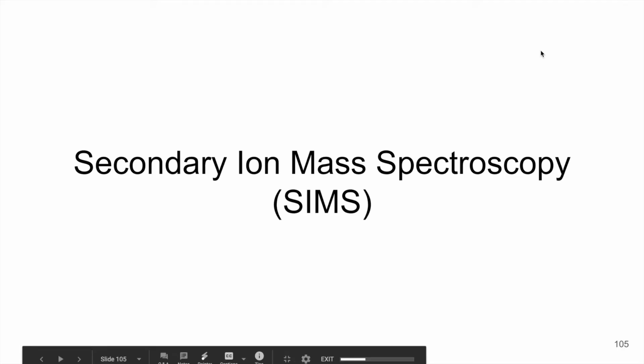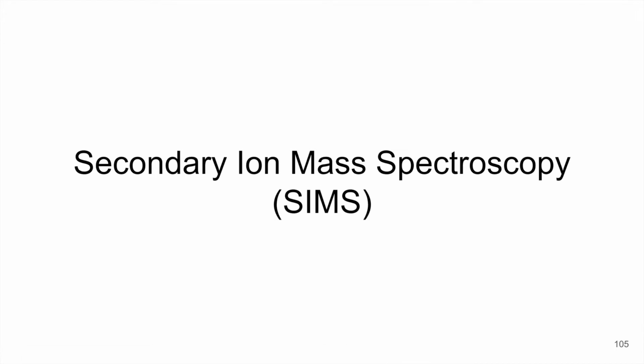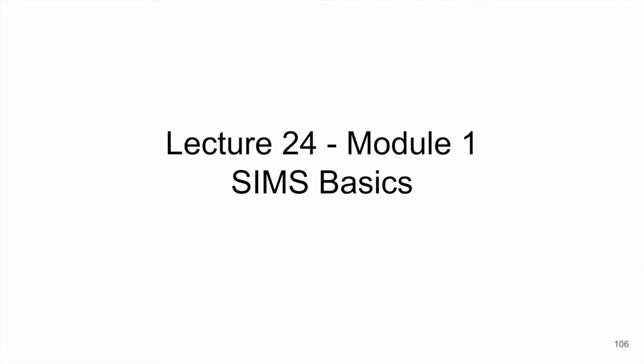All right, so for today's lecture, the last lecture, we're going to talk about SIMS, or secondary ion mass spectrometry. This is another surface sensitive technique that we talk about in connection to AES and XPS. And so the first module, we're going to talk about the basics of this SIMS technique.